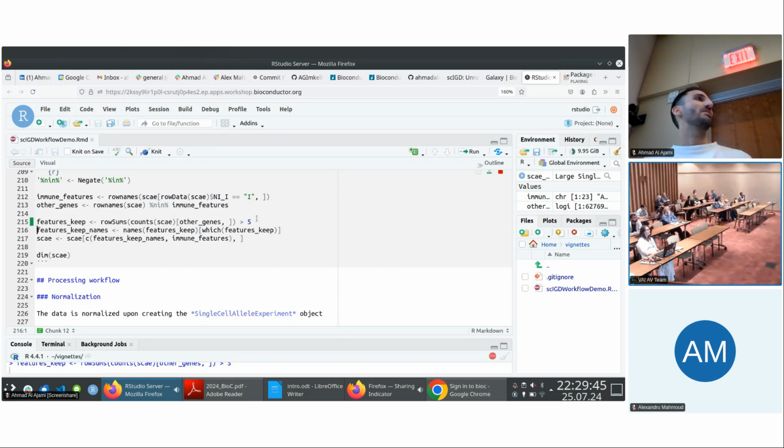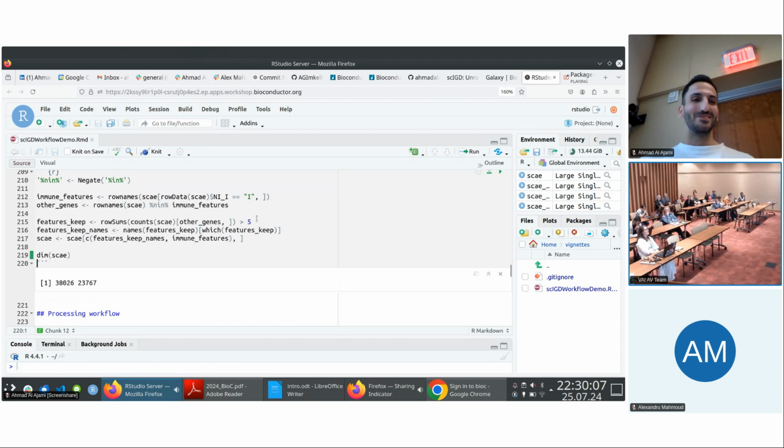Is anybody running code actually? Yeah. Okay. If I'm going too fast or too slow, let me know. If you need more time, also. Yes. Also, that Alex scaled up quite a bit if you wanted to join in. Yes, please. Although the point of the demo is to not wait for anybody, because that's kind of the point of the demo. Okay. But it's here so that anybody can go back later and do it as slowly as they want. Exactly.